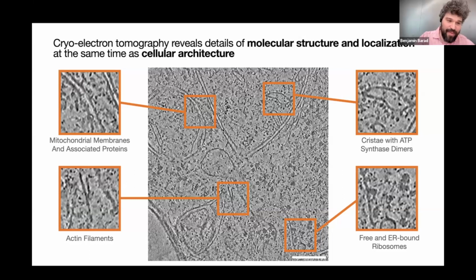So mitochondria have two membranes, so they're very easy to tell which one is a mitochondria. It's this thing coming down through, moving out of this Z plane and up and around here, and then back down and up this way. This is endoplasmic reticulum crossing over it. So endoplasmic reticulum marks sites of mitochondrial fission.